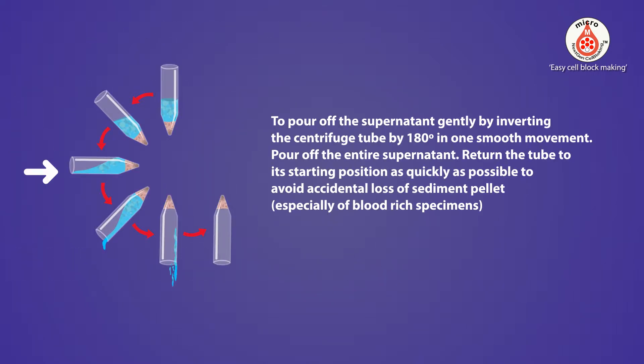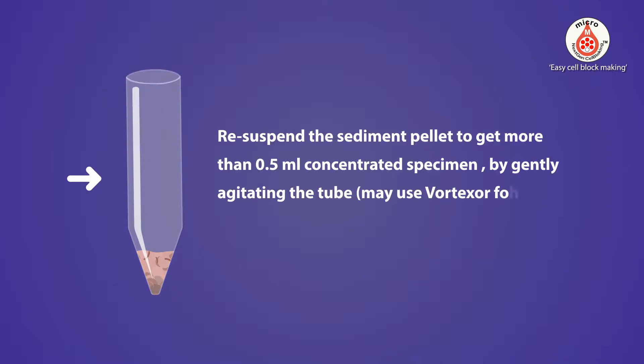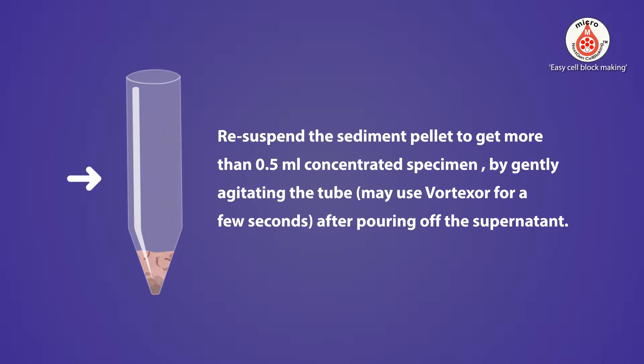To pour off the supernatant, gently invert the centrifuge tube by 180 degrees in one smooth movement. Pour off the entire supernatant. Return the tube to its starting position as quickly as possible to avoid accidental loss of the sediment pellet, especially with blood-rich specimens. Re-suspend the sediment in minimal supernatant to get more than 0.5 ml of final concentrated specimen.